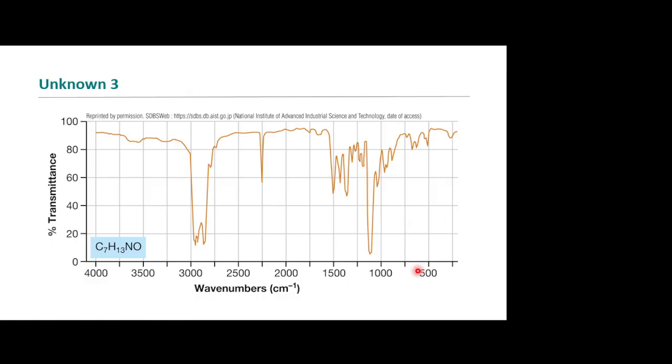Okay, folks. So you should have made some decent progress right now. Again, we start where again? Upstream. Yep, upstream. Very good. Good usage of the language. Okay, and what are we specifically looking at in this case? So what sort of hydrogens do we have? Alkanes, yeah. So we have CHs that are just the normal CHs off of an alkane, right? And that's that 2800 typically to 3000, right?